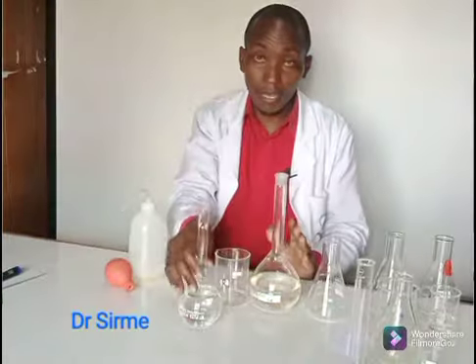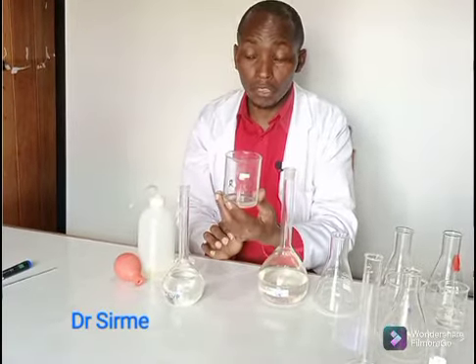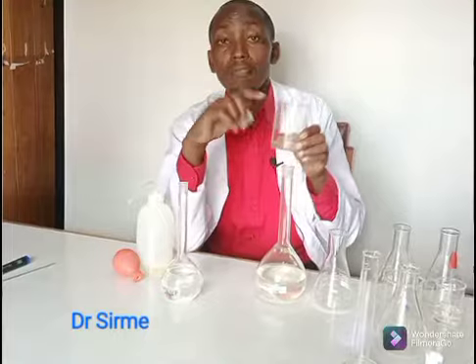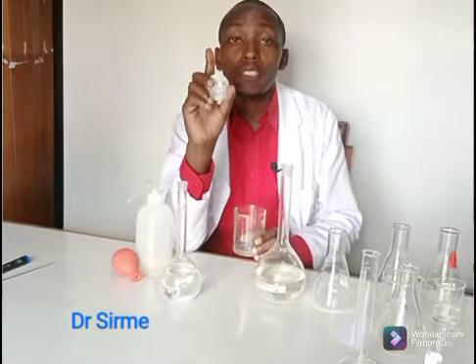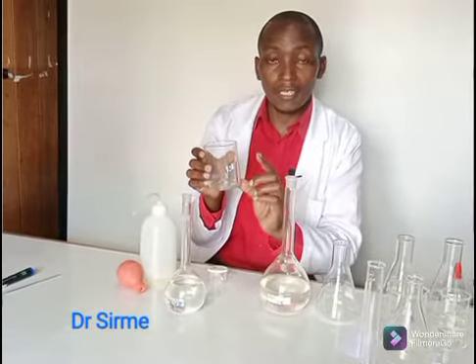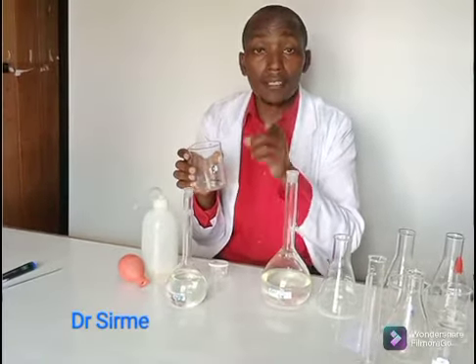I took 50 ml of solution P. I placed it into an empty beaker. And in this case, I added the carbonate. The acid in this case must be in excess. The calcium carbonate in this case was the limiting reagent, so all of it has to react. And once all the carbonate has reacted, some amount of HCl in this beaker remained unreacted.